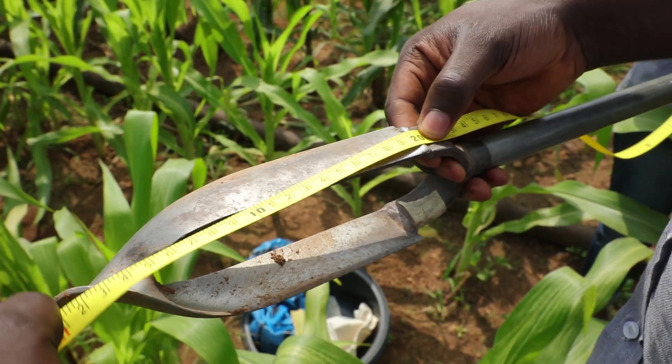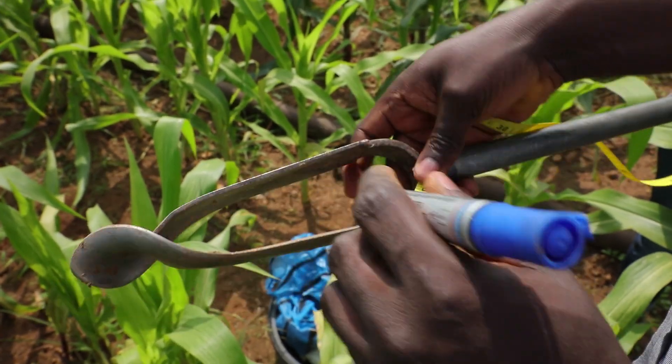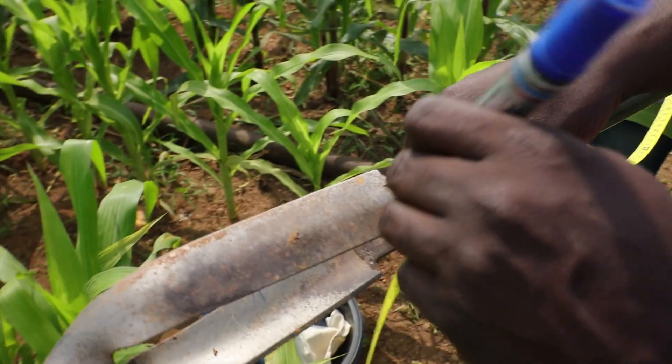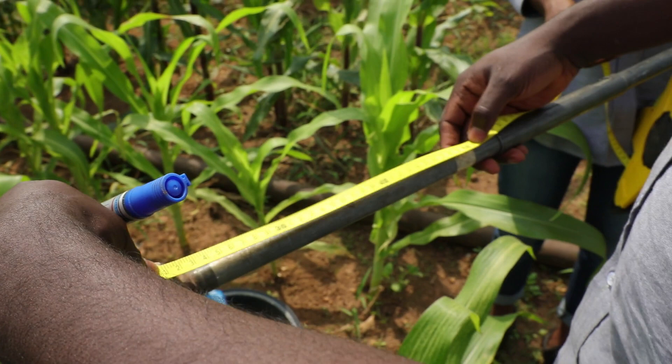Use the permanent marker to mark the auger at 20 centimeters and 50 centimeters. The 20 centimeter mark shows the depth from which the topsoil sample will be collected. Subsoil will be collected from the depth between 20 and 50 centimeters.